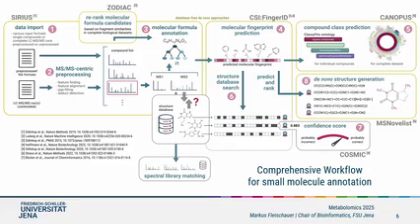All of this is packed into a quite complex workflow. Unfortunately, it's much easier in the software. I will now try to walk you through this workflow a bit so that you know what all the bits and pieces mean and what they are good for.